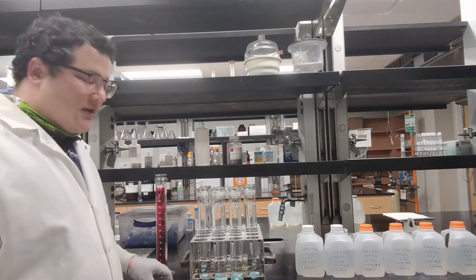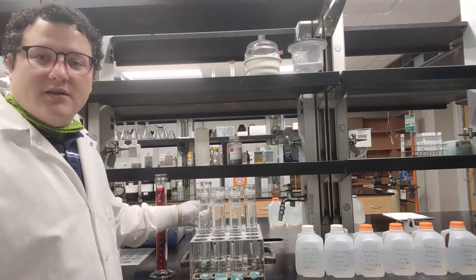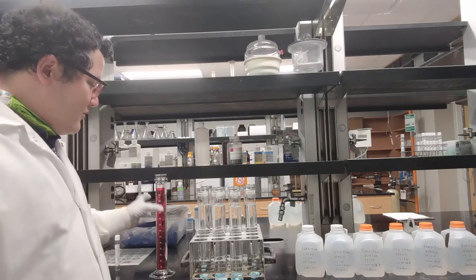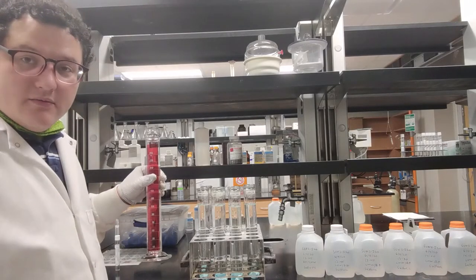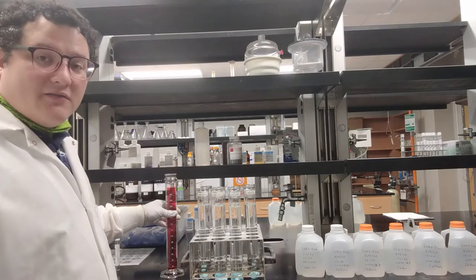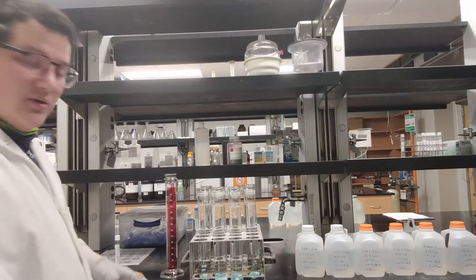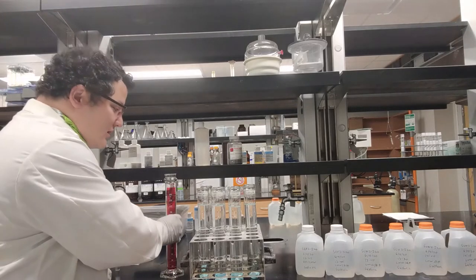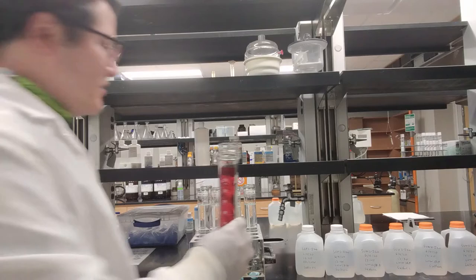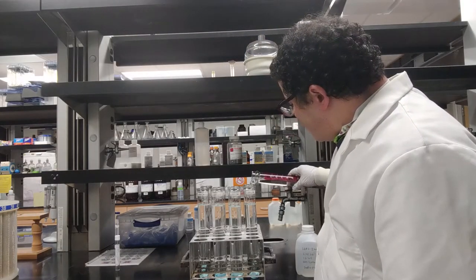I've got all of the vessels filled up with the sample water, and also the blank has deionized water in it. I was rinsing my graduated cylinder in between filling. I have not yet filled up the spike because I want to show you how I do that. It also takes 250 milliliters of deionized water, but I'm not going to put it all in at once — I'm going to put about half of it in.